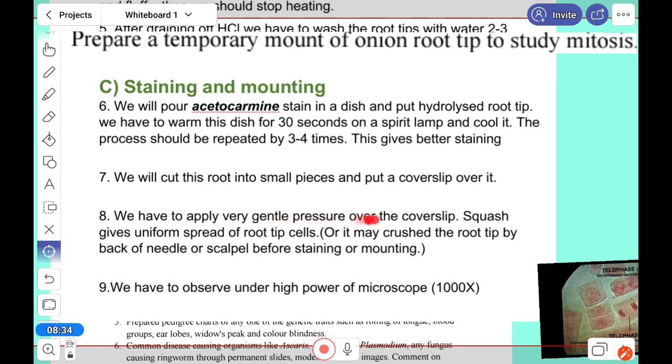After that, we'll cut it into small pieces, put the cover slip, and apply very gentle pressure with a blunt end, like a pencil or pen. Squash it, which means squeeze it. It may be crushed. Before that, sometimes we are doing it, and we have to observe under high power microscopy, oil immersion, thousand X.